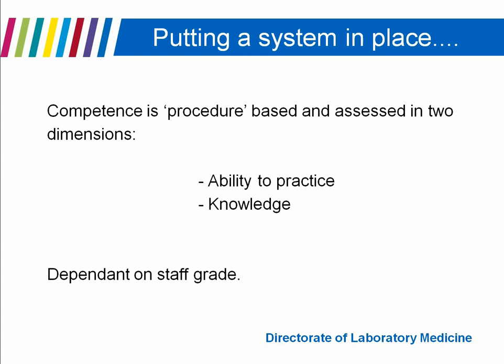And that obviously is dependent on staff grade, so the assessment an MLA would undergo would be different to a biomedical scientist, for example. And the assessments are carried out usually by senior members of staff who have had a reasonable amount of in-depth training and experience to oversee the assessment.